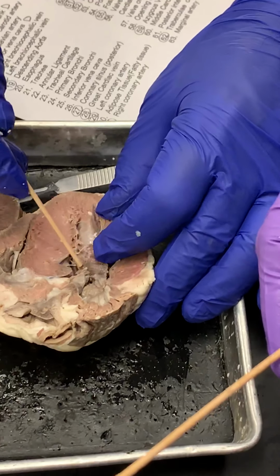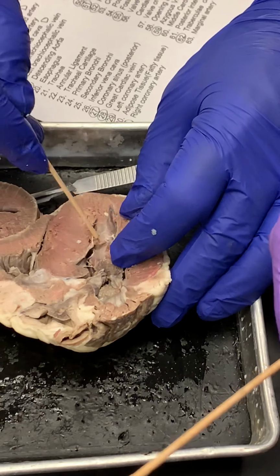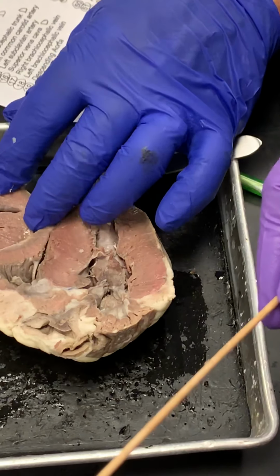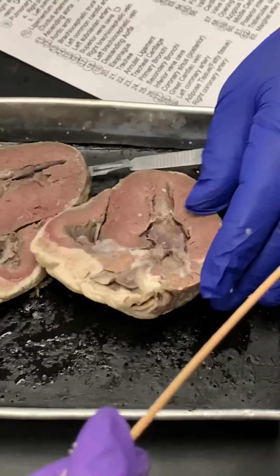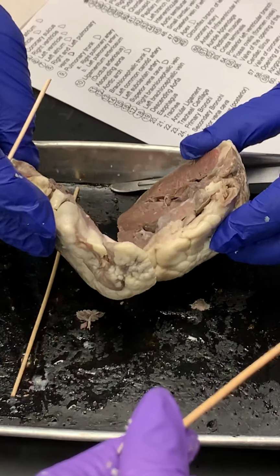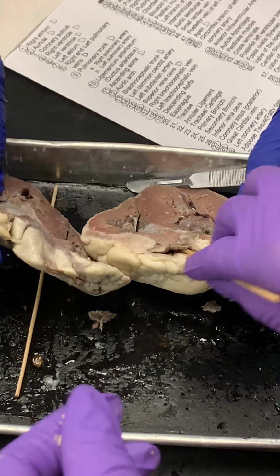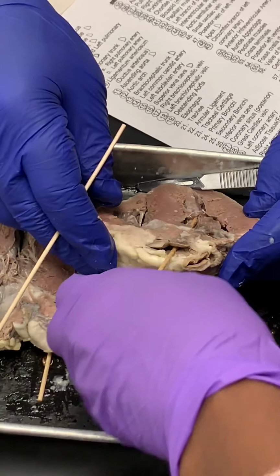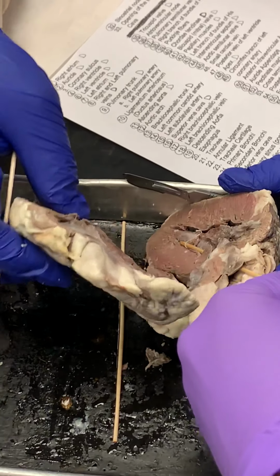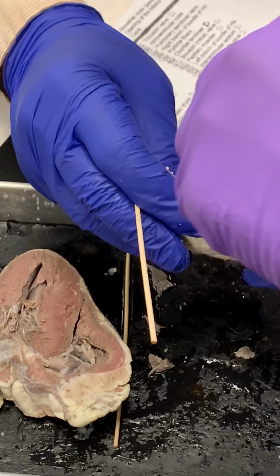And this is a giant papillary muscle, right? Because if you see the chordae tendineae piercing right into it, then that has to be the papillary muscle. That one's huge. Since you cut it in half, it's hard to see the aorta because you kind of destroyed it. This is the aorta. Oh, you cut it and maintained it all on one side. So that was pretty close. Yeah, and this is the pulmonary trunk.